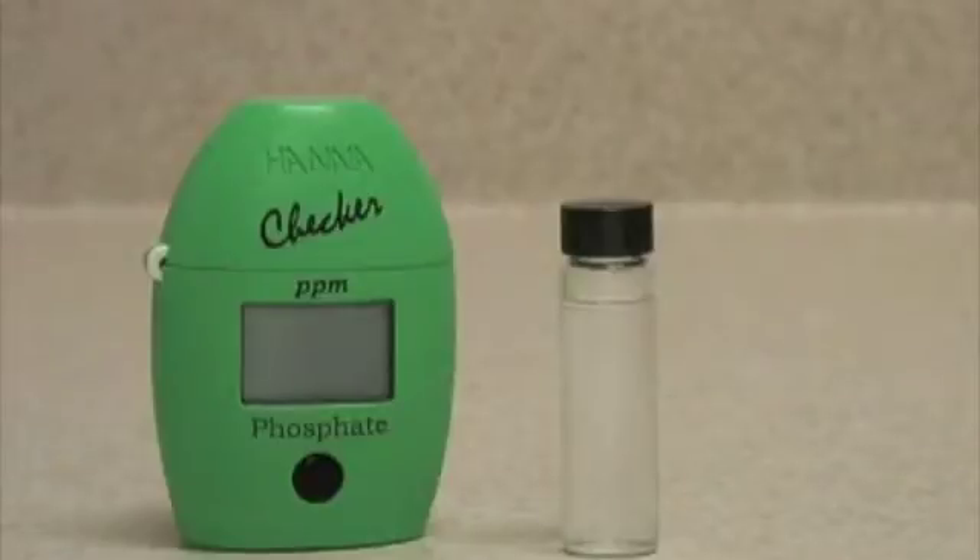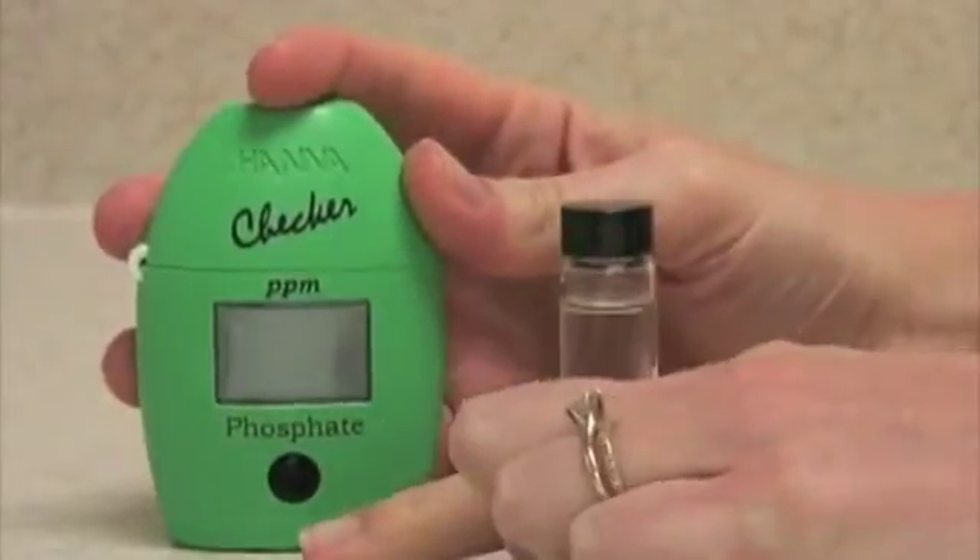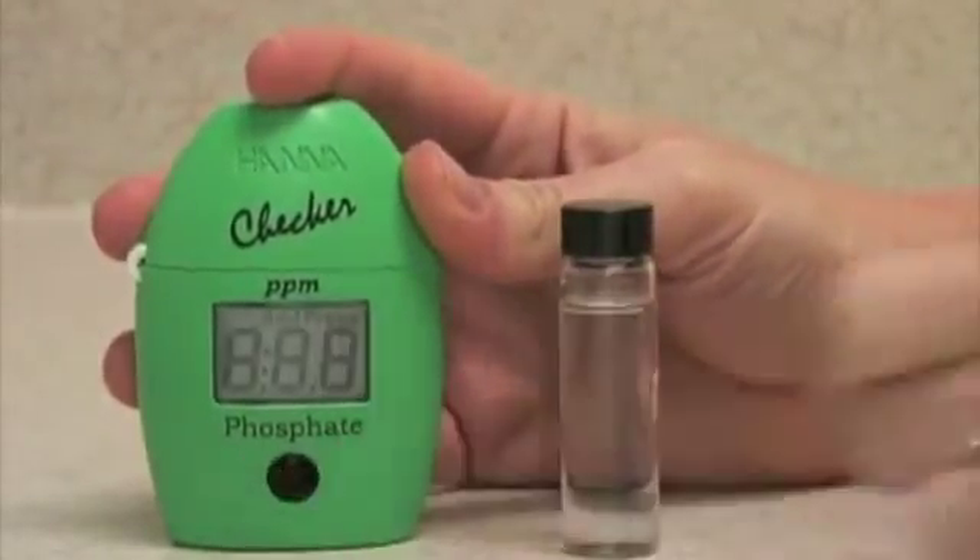This is the Hanna Instruments Checker HC Meter for Phosphate. This meter is very easy to use. To operate, it's a single push button. Push the button once to turn it on.